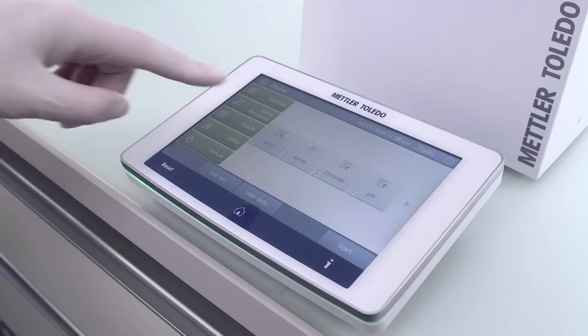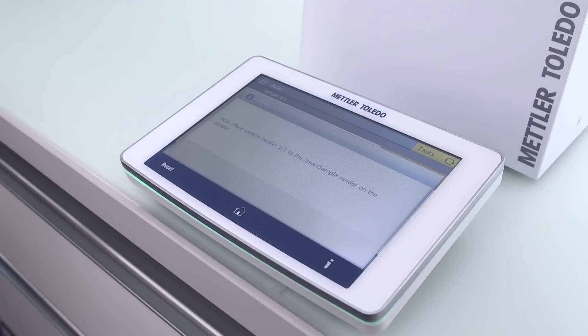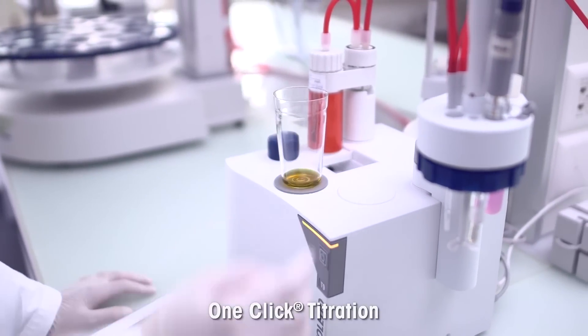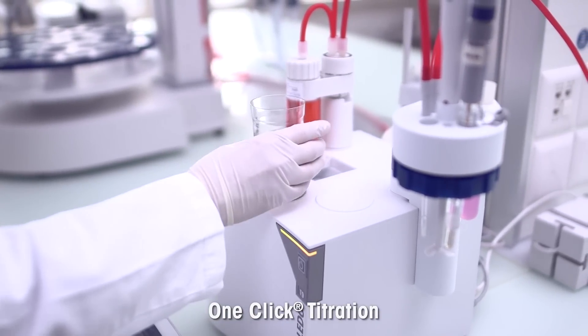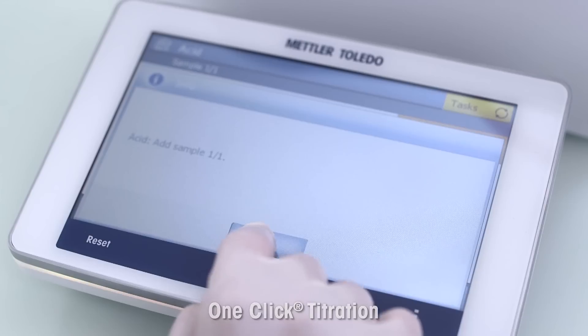SmartSample prevents transcription and sample mix-up errors. Thanks to the one-click usability concept, analyses are executed with just one simple keystroke.